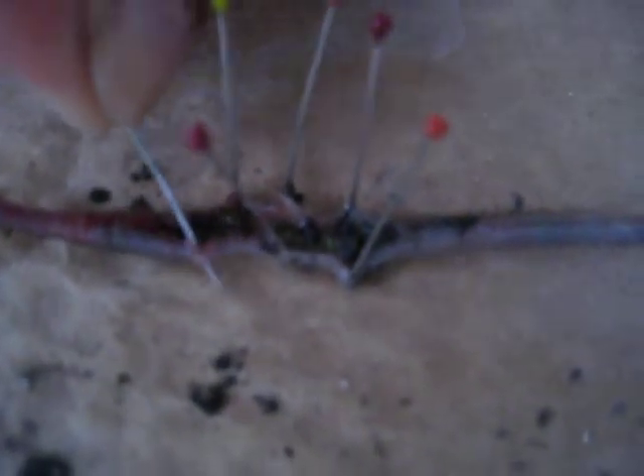Yeah, I got kind of scared, I guess. That's the anus with the poo coming out. Sticking more pins in.